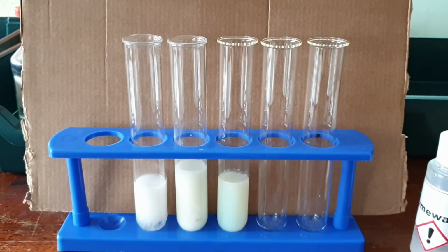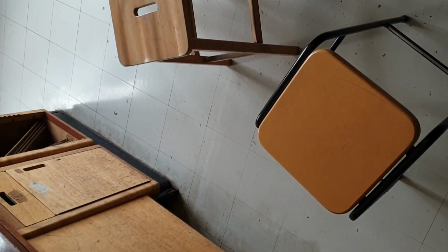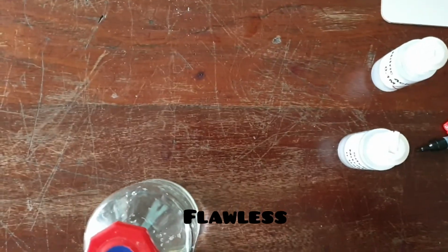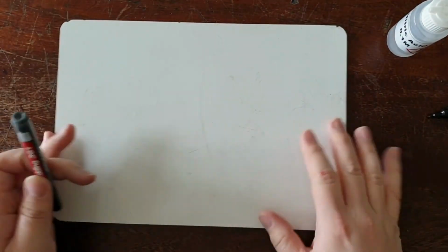So that is your test for carbonate, sulfate, and halide ions. There is one more, but I'm going to try and rearrange my camera so that I can write a bit more. Okay, let's try that. So, to recap, thanks for sticking with this.